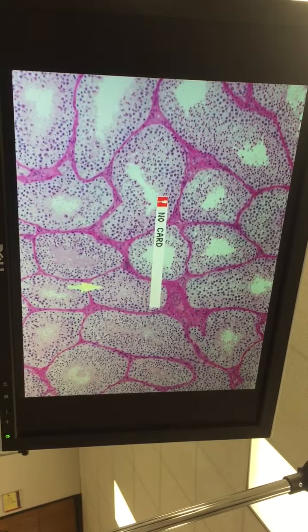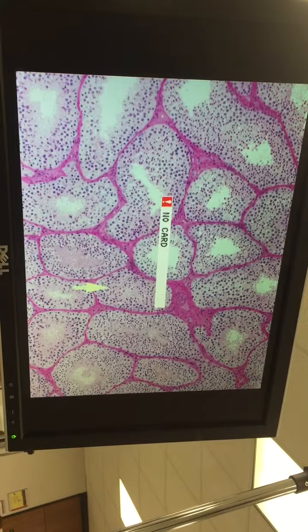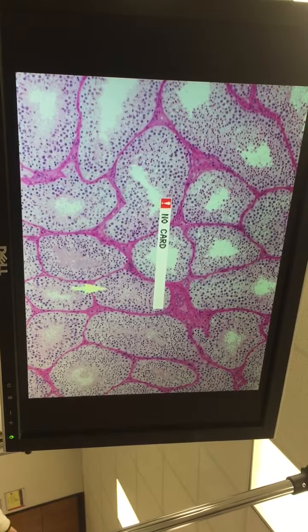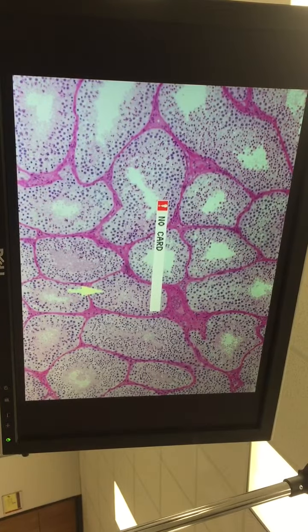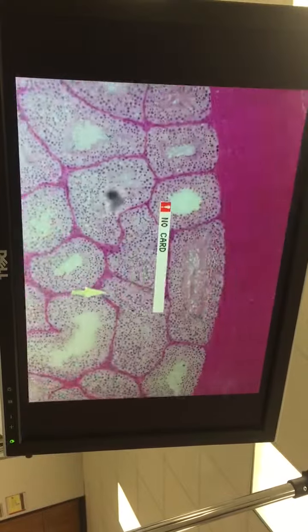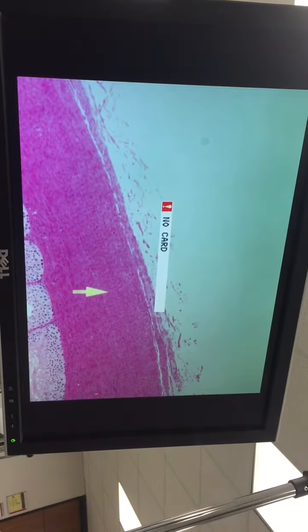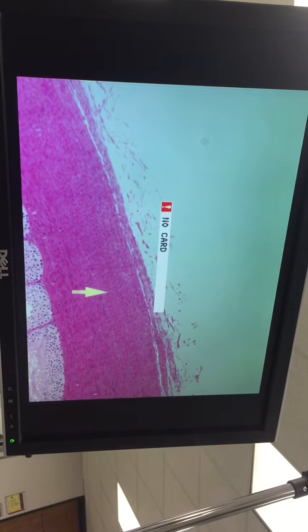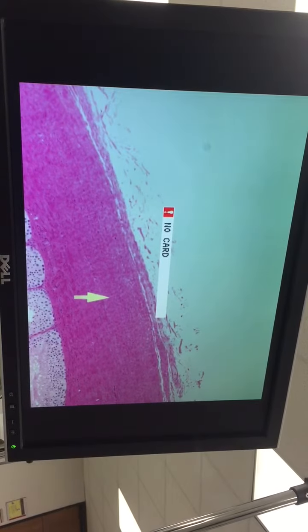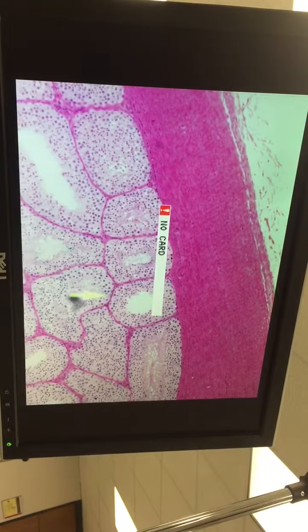Okay, for the male reproductive system, there are essentially 4 slides to look at. Unfortunately, we do not have a slide of the seminal vesicle. So we have testes here. This is a plastic section from the monkey, and right out there, that's the tunica albuginea. Rather substantial. And really, we only have a portion of the testes here, but we have another slide we'll look at.